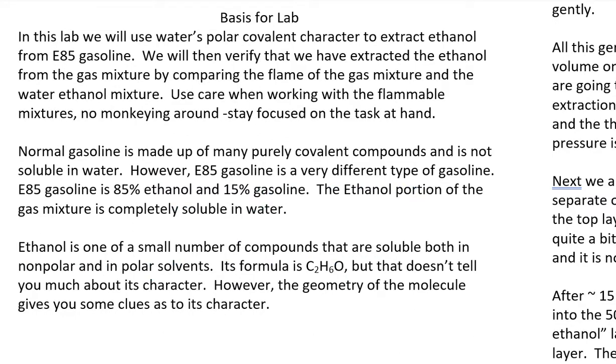So in this lab, we're going to use water's polar character to extract ethanol from E85 gasoline. Now, E85 gasoline is not regular gasoline. E85 gasoline is gasoline that has 85% ethanol in it and 15% gasoline.